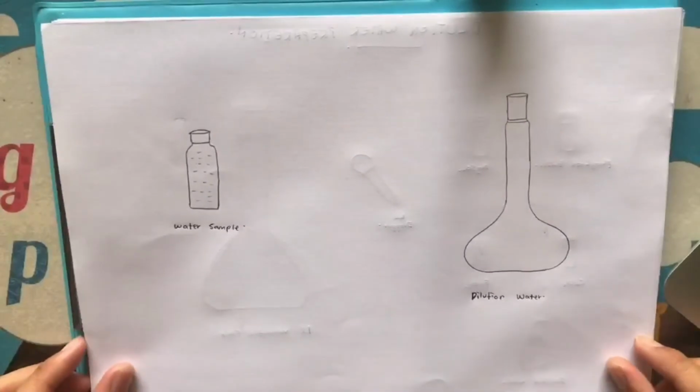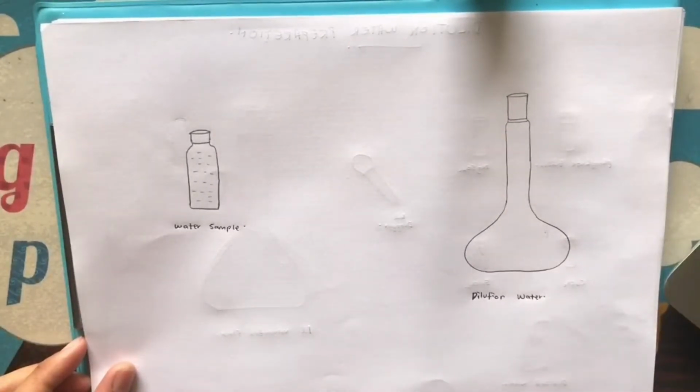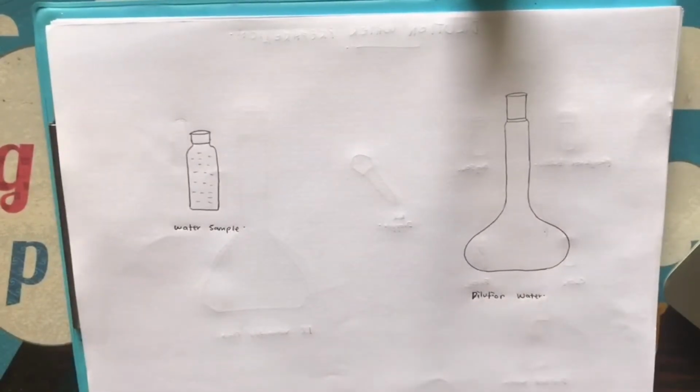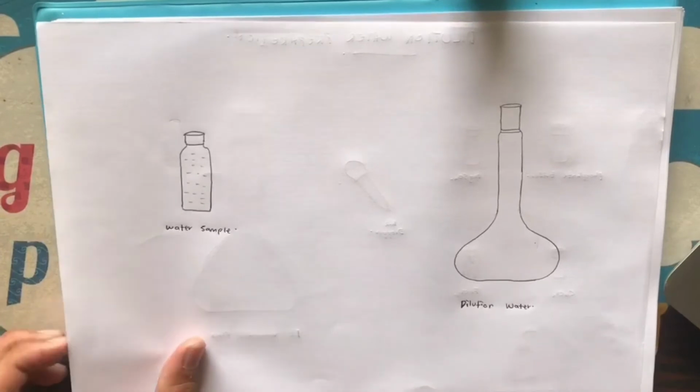Next, dilute the sample to an appropriate dilution factor using dilution water. After that, mix and aerate the diluted sample until saturated with air.